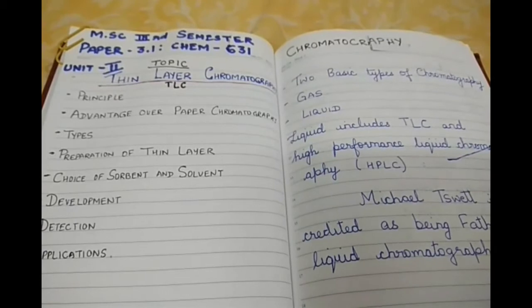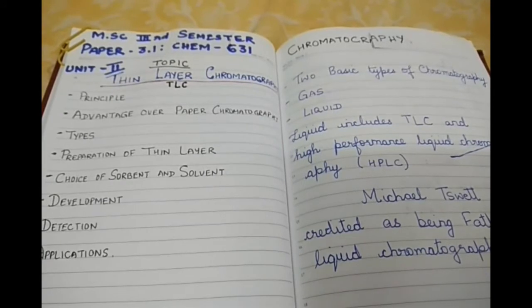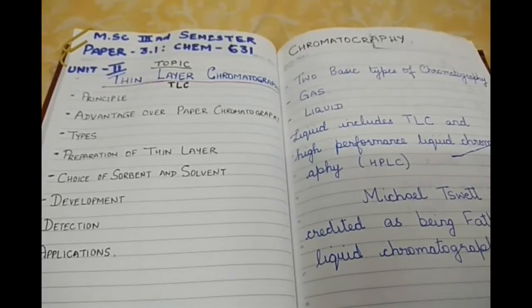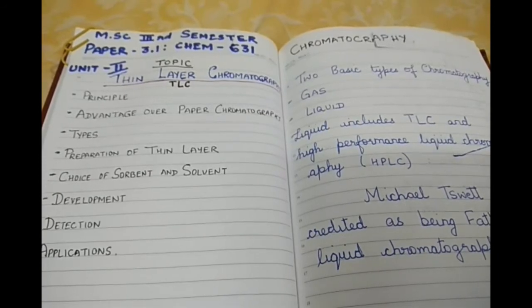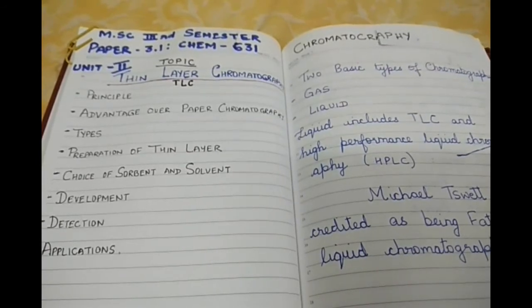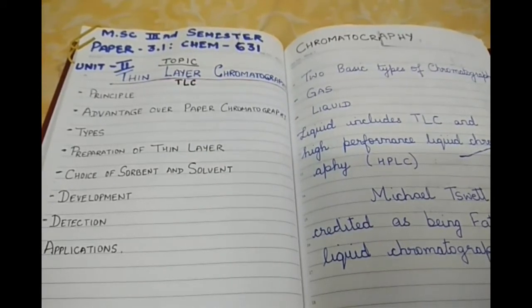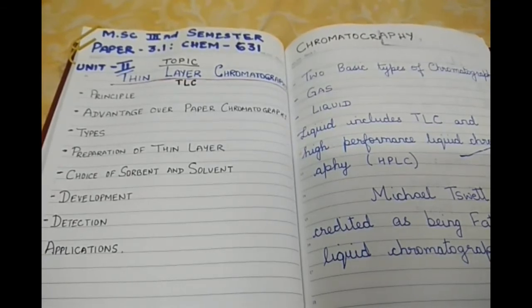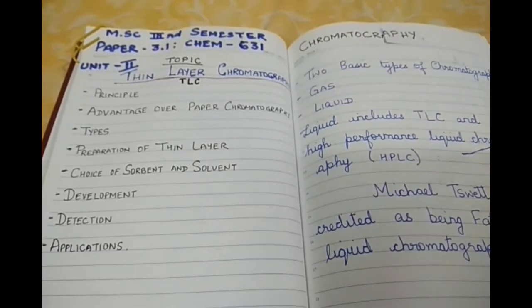In my today's lecture, I will be discussing the topic for M.Sc third semester students, paper 3.1, chemistry 631 code, and my topic is chromatography, unit 2nd. In this chromatography, we will be discussing thin layer chromatography, which is abbreviated as TLC.